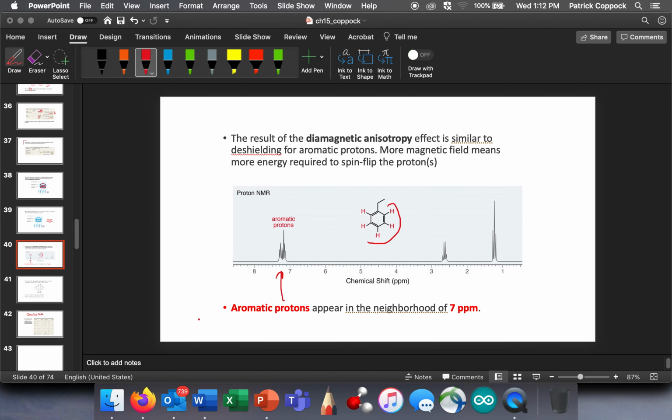Okay? So it's way down there. This is super characteristic. Matter of fact, earlier in a previous conversation, I looked at this spectrum. I didn't even see this here, and I knew immediately because this was down here in this region. I knew it was hydrogens on a benzene ring, right? Because your eyes are just going to get used to it, and you'll immediately recognize it.